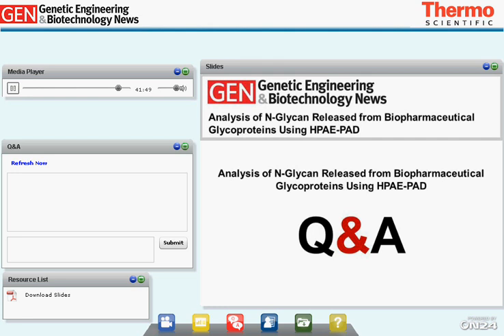Okay, and where do you get your oligosaccharide reference standards from? Well, on one hand, we prepare them on our own from different glycoproteins. We are purifying them after PNGase digestion using different chromatographic steps. But also we get them commercially. There's a company called ProteinS from Portugal, where they have a huge selection of glycan reference standards. Those are our sources.